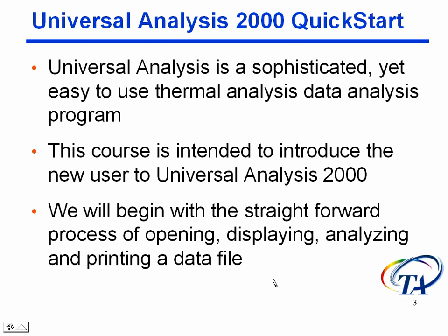Okay, Universal Analysis is a sophisticated yet easy-to-use thermal analysis data analysis program. It's specifically designed for thermal analysis data. It was created by thermal analysts. The programmer who did the programming actually is a thermal analyst. He's one of the people that developed modulated DSC. It is extremely powerful. There's a whole bunch of stuff in there. There's checkboxes everywhere to give you all kinds of options. Everything can be saved. It's very customizable.